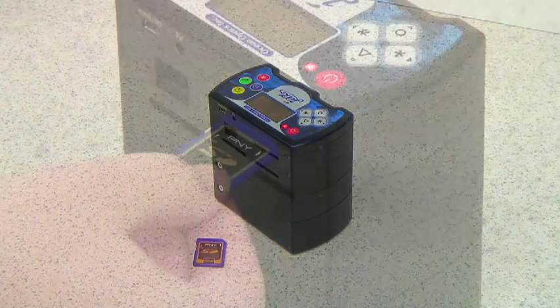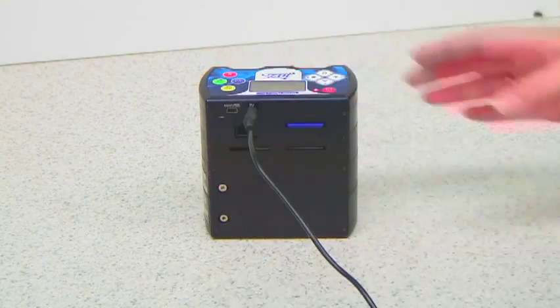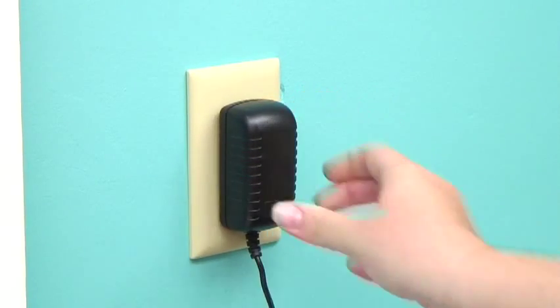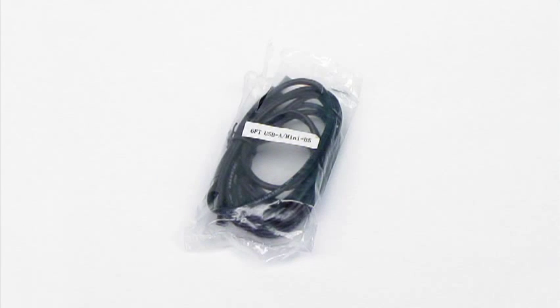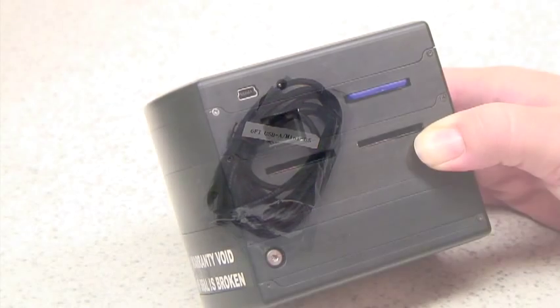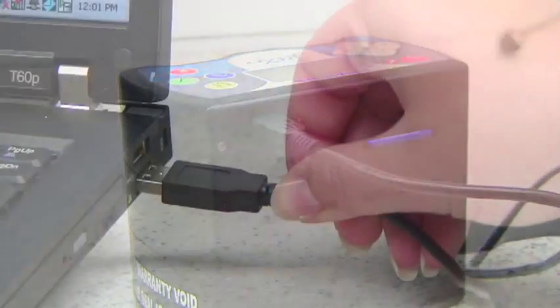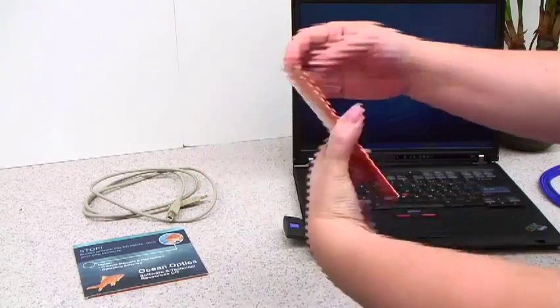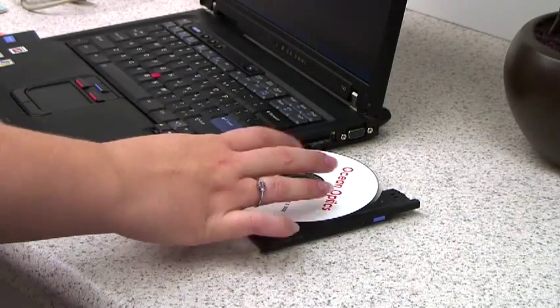Data storage is possible by means of an SD card, and a DC power supply enables the JAZZ's lithium-ion battery to recharge. You can also recharge over USB or a Power over Ethernet enabled network. Finally, there are two cables that can connect your JAZZ to a PC: the Ethernet and Mini-USB cables. The Ethernet cable allows you to connect to Spectra Suite through the network, while the Mini-USB allows you to connect directly to the computer. Don't connect your spectrometer just yet — you'll need to install the Spectra Suite software first. For further help on installation, be sure to check out our online video tutorials.